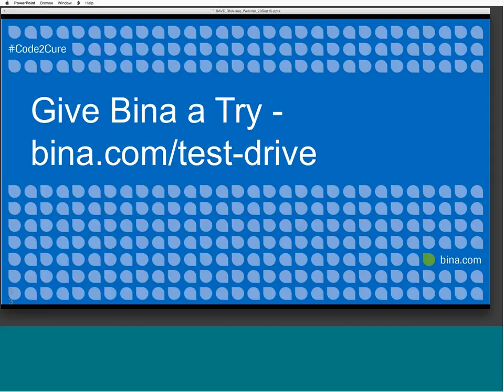So here's another question. Please comment on Sailfish and Kallisto. For those who are unfamiliar, Sailfish and Kallisto are quite interesting tools. Instead of doing alignment to a genome, they break the read up into k-mers and do a k-mer match with a reference transcriptome. So these tools are able to quantify the expression of transcripts, but only known transcripts.